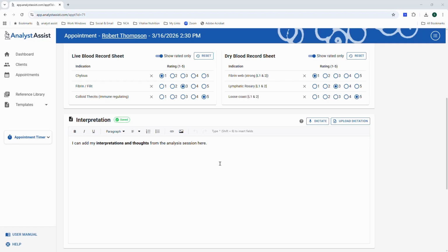As well as understanding, punctuating and transcribing live text, you can also use specific command words to control the process. To view the command words available, click the help icon. Again, you can read about these in the user manual, but for now I'll make a short demonstration to show some of the options.